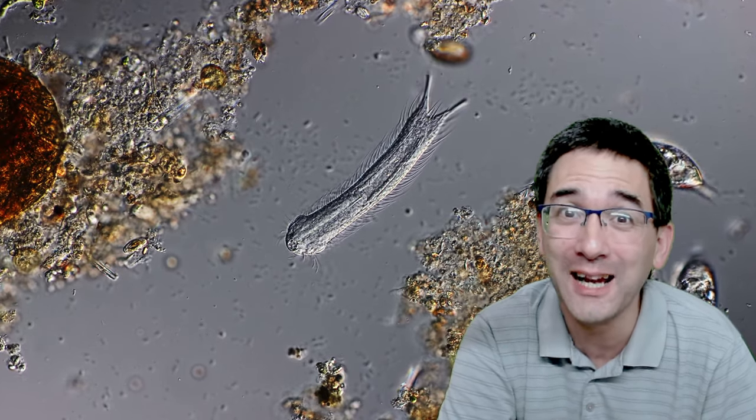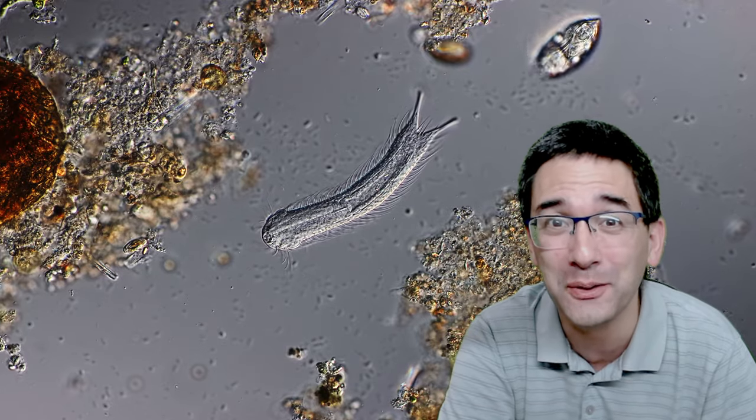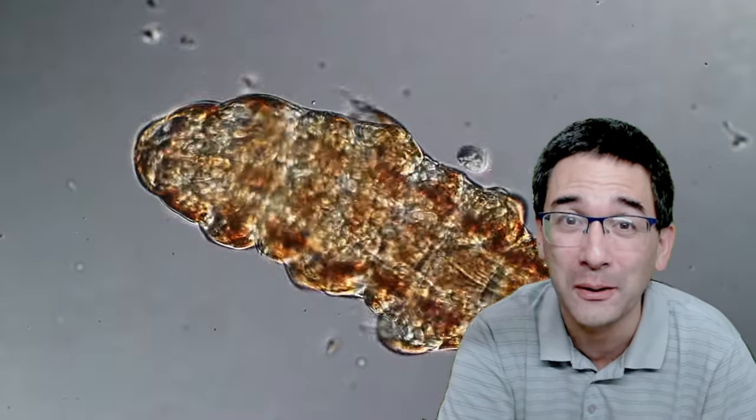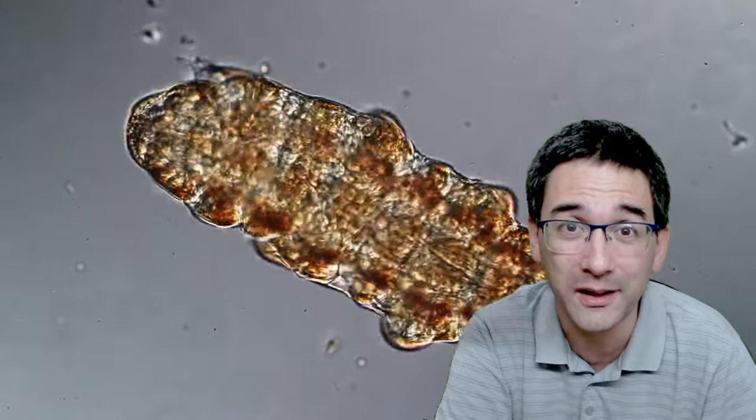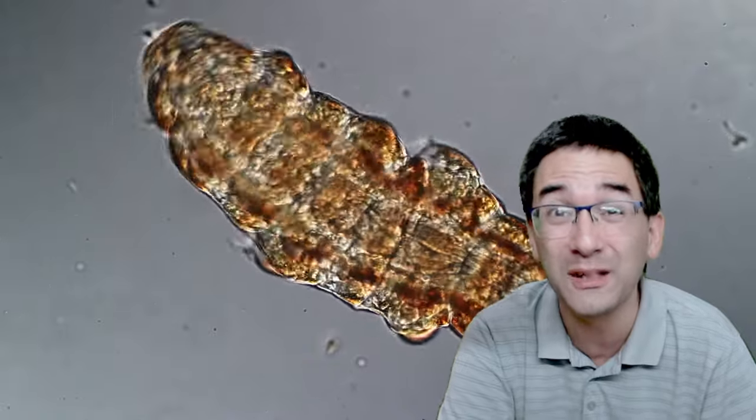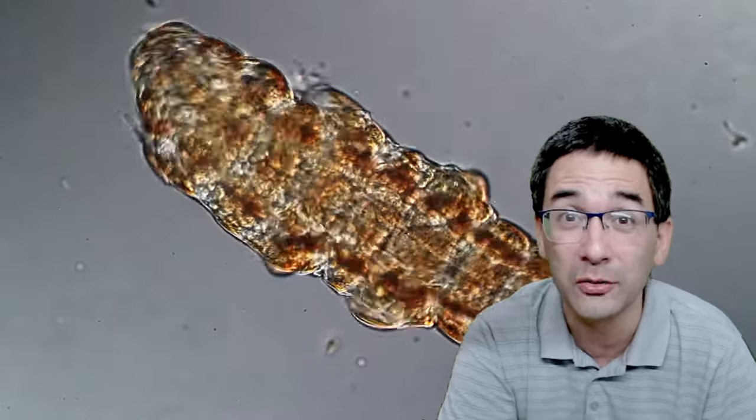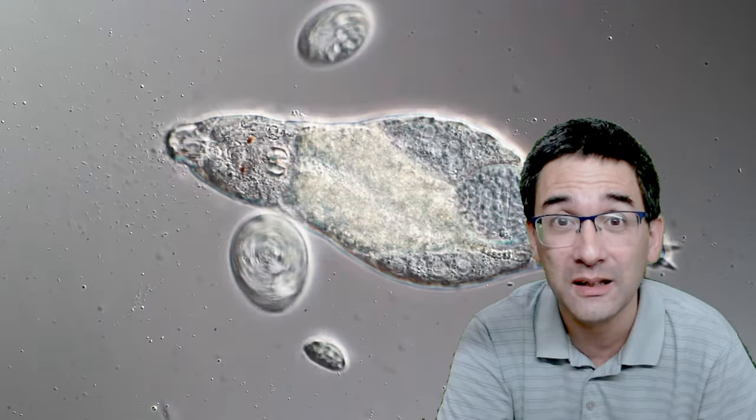But reality is not always like that. In many cases when you put a sample under the microscope, it looks kind of boring and pretty dead.